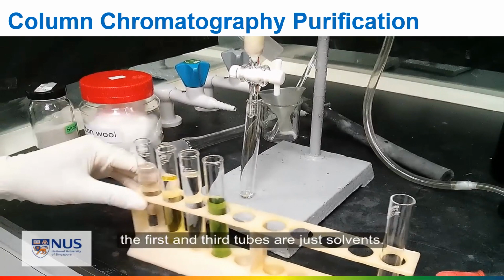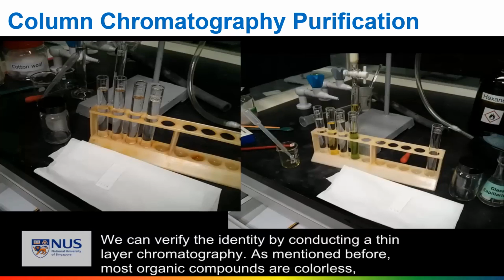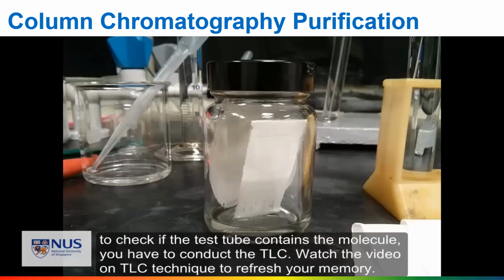We can verify the identity by conducting a thin-layer chromatography. As mentioned before, most organic compounds are colorless, so to check if the test tubes contain the molecule, you have to conduct the TLC. Watch the video on TLC technique to refresh your memory.